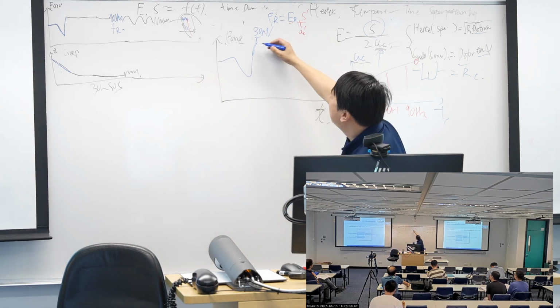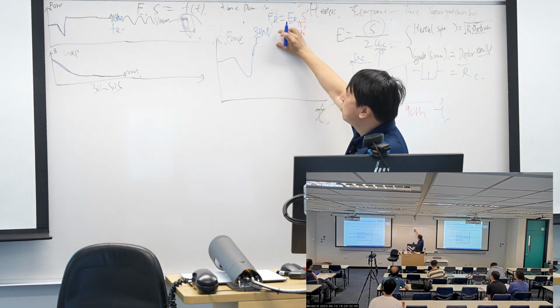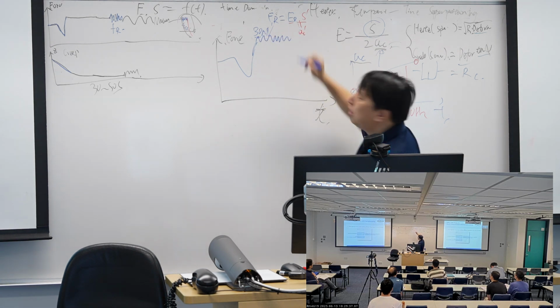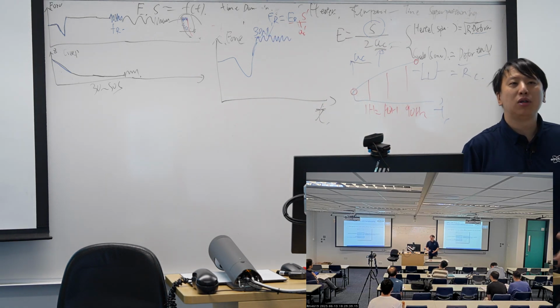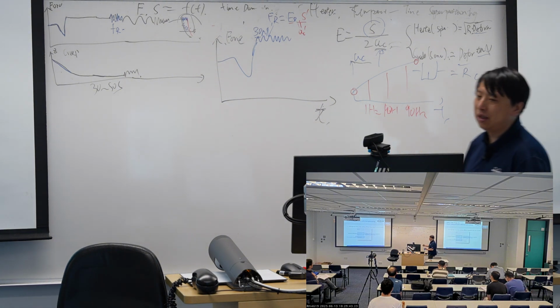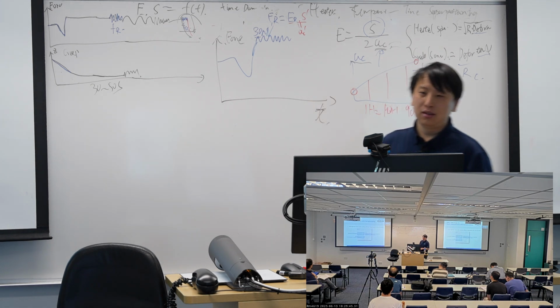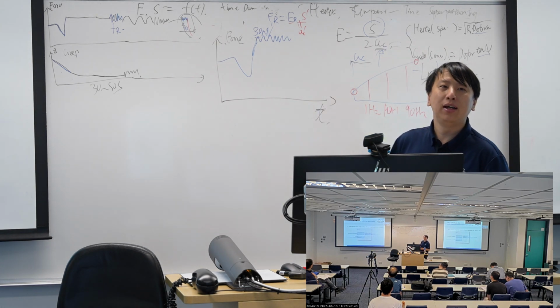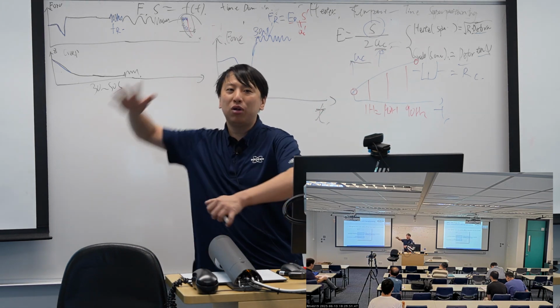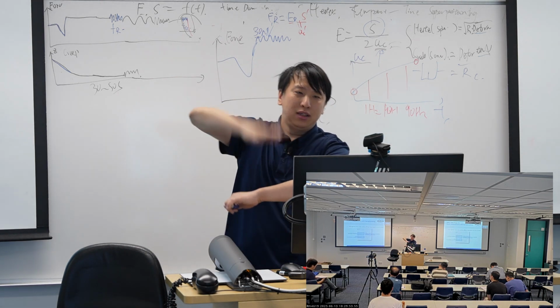So you can apply a large force, cause large deformation, and a tiny modulation force to change the deformation quite tiny. As such, you can measure the DMA correctly. Yeah, it's the same as the macro scale DMA. You don't want the modulation to damage your sample dramatically.